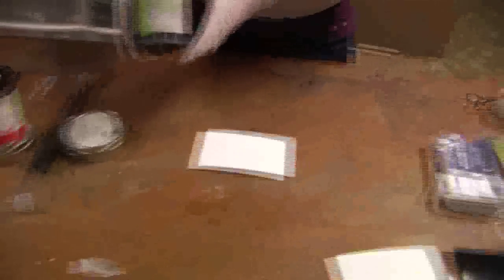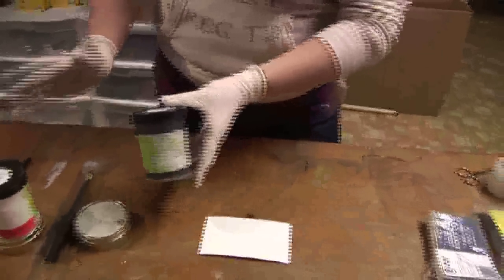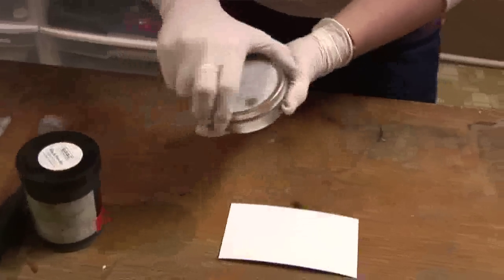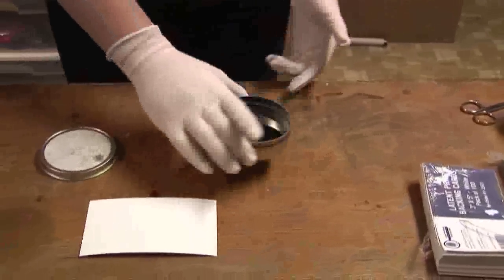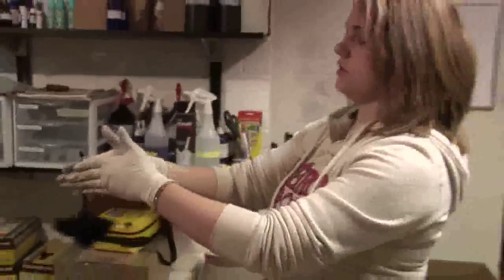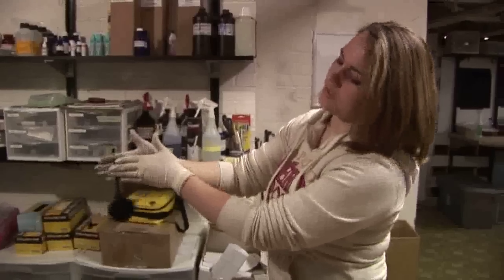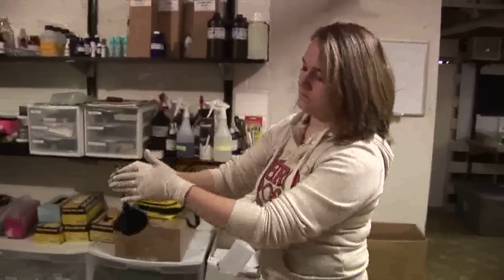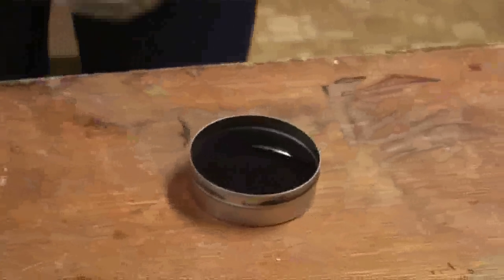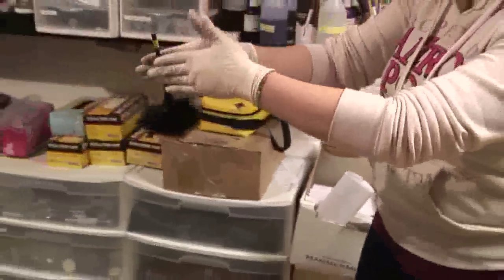The dust comes in big jars like this, but you never want to stick your brush into the large jar. You want to make sure you have your own little reservoir of dust. The first thing you always want to do is clean off your brush — twirl it between your fingers like this to remove any excess dust. Then you just dip it lightly into your dust, shake off the excess again, and then you can start dusting.